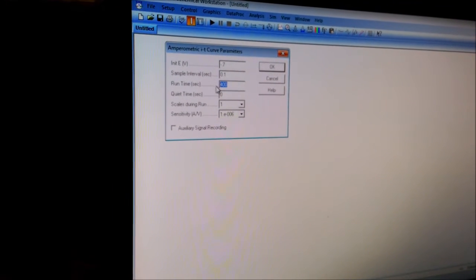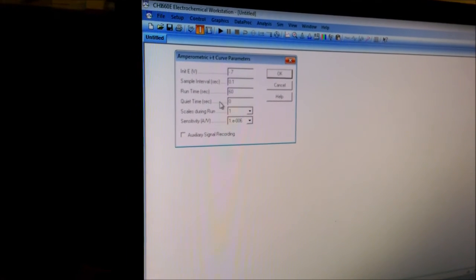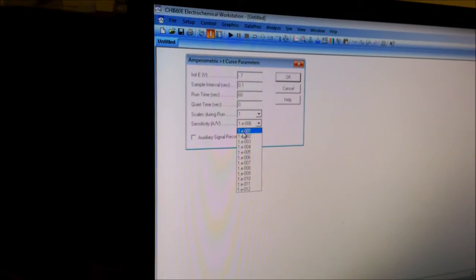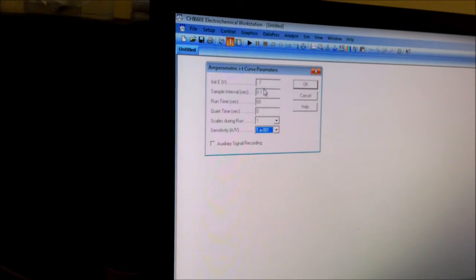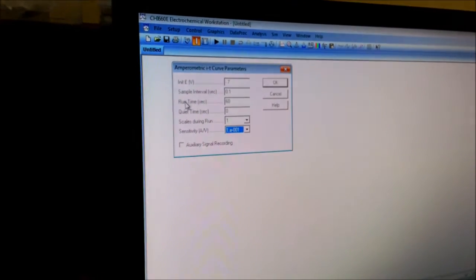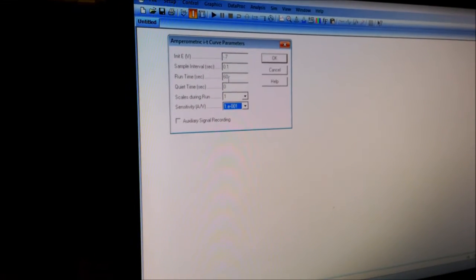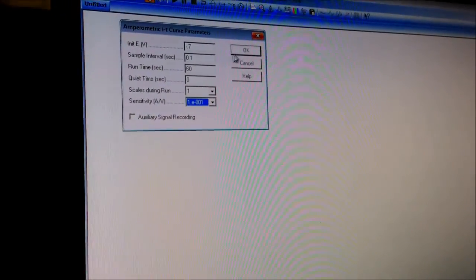I am choosing the current sensitivity as 10 to the minus one. The initial voltage is minus 0.7 volts and the run time is 60 seconds. You can choose the time according to your own requirement — I am just demonstrating it.